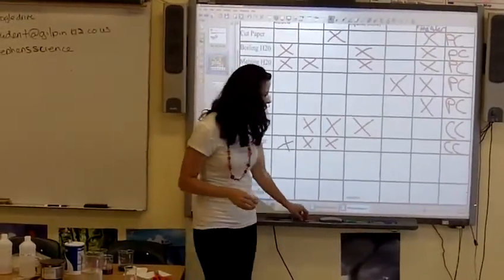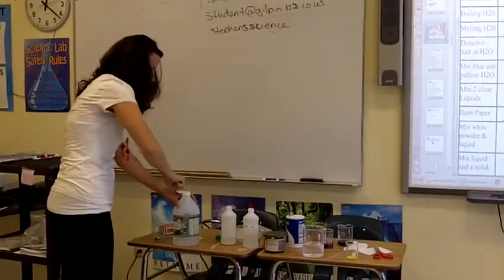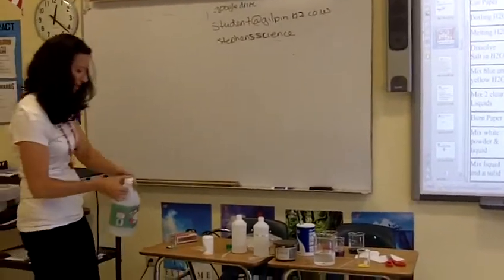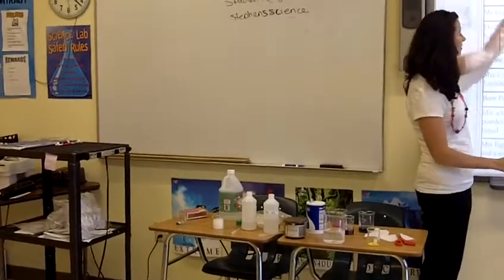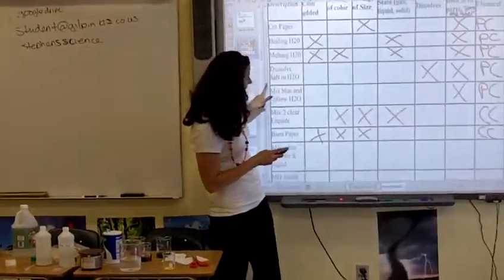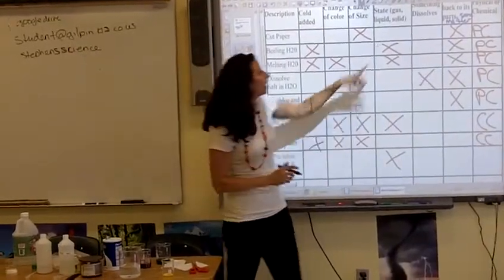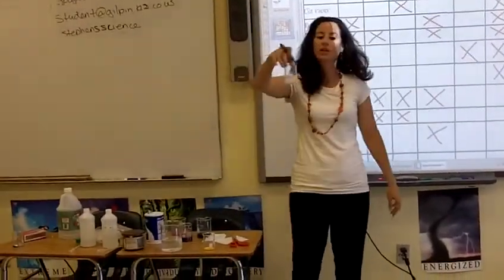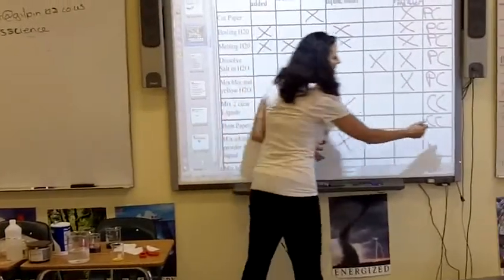The next demo: mix a white powder and a clear liquid. I'm adding a clear liquid to a beaker with a white powder — whoa, made a little mess! The bubbles you see created a gas. Was hot or cold added? No. Change in color? No. Change in size? No. Change in state? Yes — we added a liquid and a solid, and it produced a gas. Did something dissolve? No. Can it go back to its parts? No — it's not the same type of matter anymore because it created a gas from a liquid and a solid. That's evidence of a new substance forming, so it cannot go back. Chemical change.